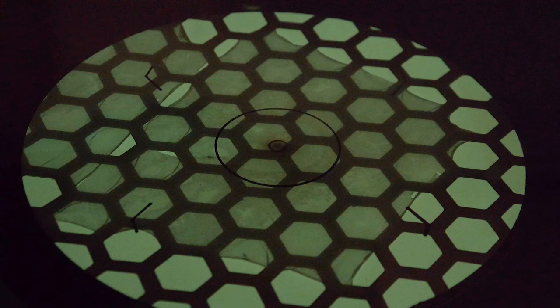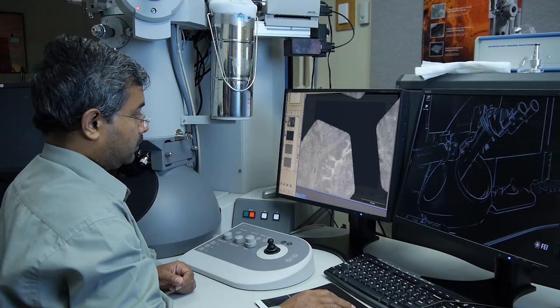The vacuum is restored. The section can be viewed either by looking at the fluorescent screen in the microscope or by viewing a monitor.